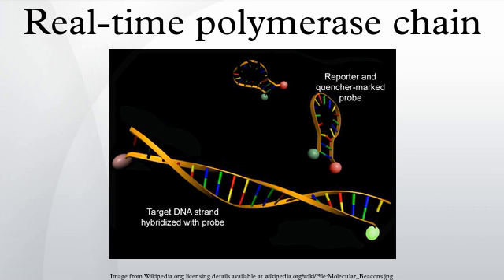The first, at around 95 degrees Celsius, allows the separation of the nucleic acid double chain. The second, at a temperature of around 50–60 degrees Celsius, allows the binding of the primers with the DNA template. The third, at between 68–72 degrees Celsius, facilitates the polymerization carried out by the DNA polymerase.